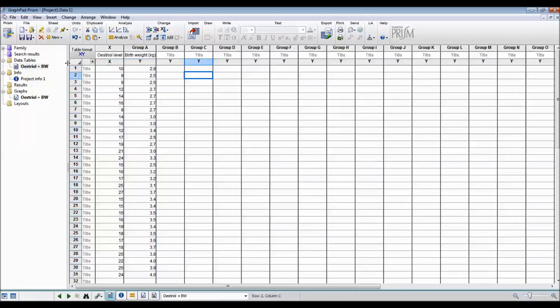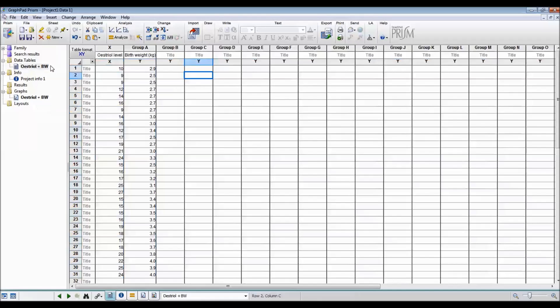I always like giving the different data tables a name. This is especially important when you're doing lots of analysis.